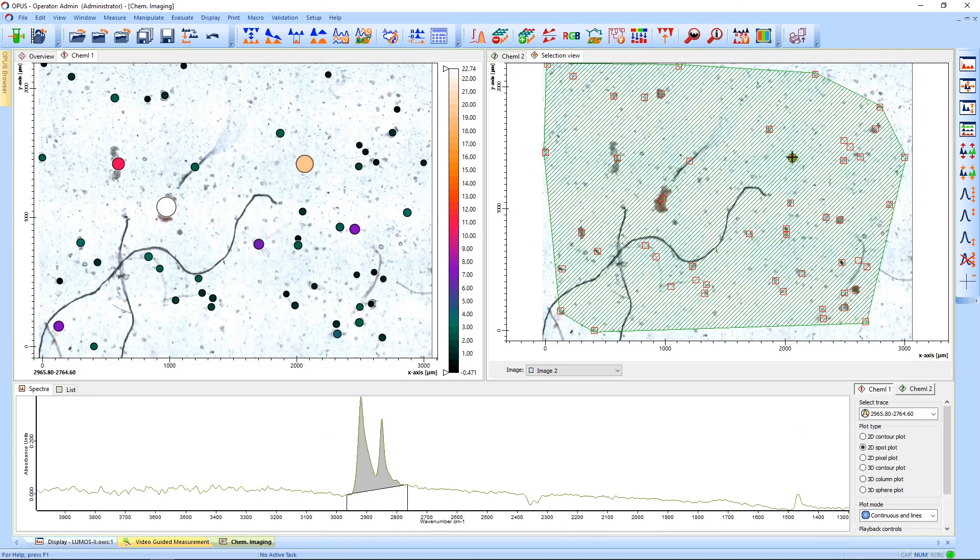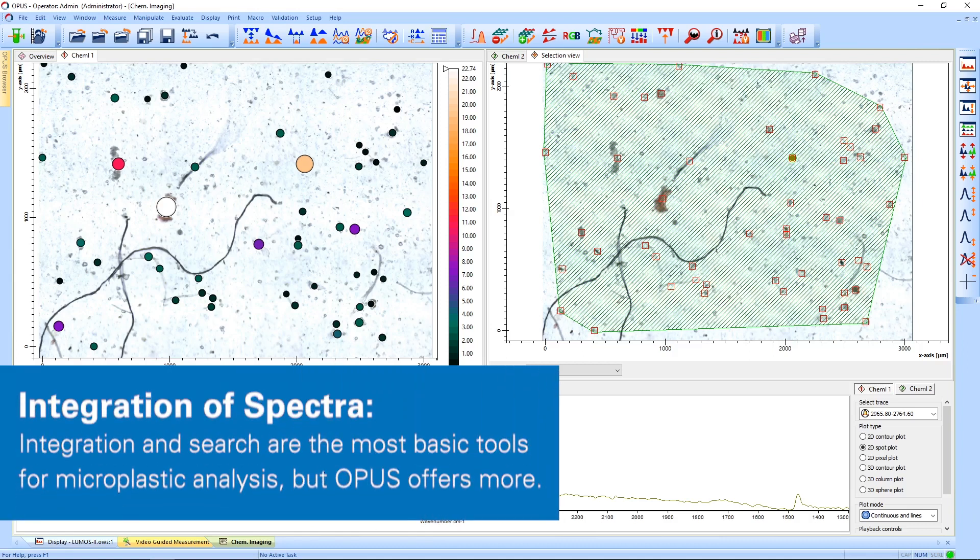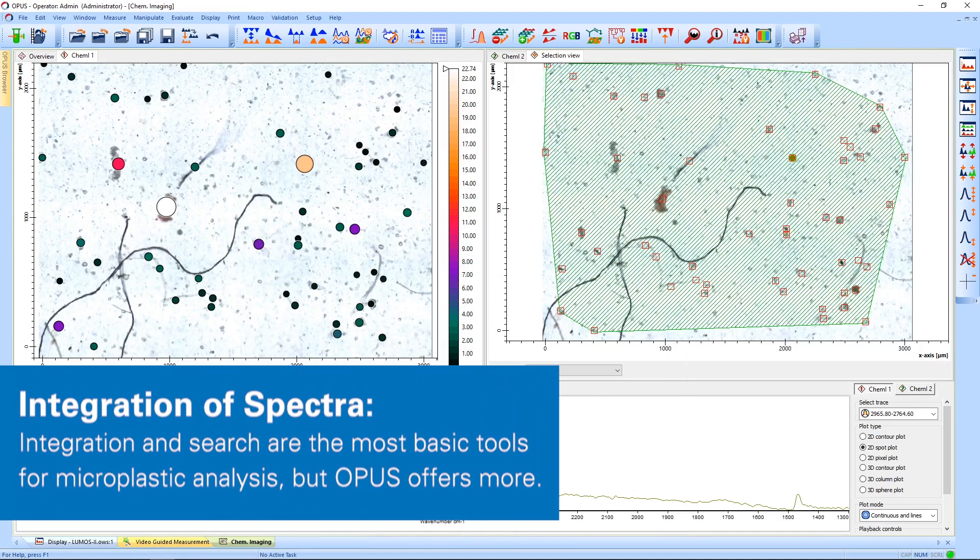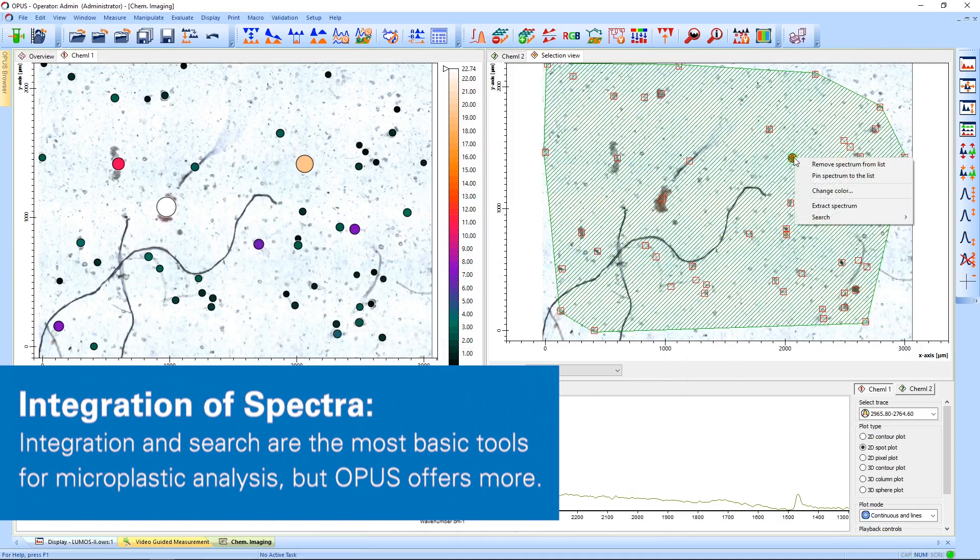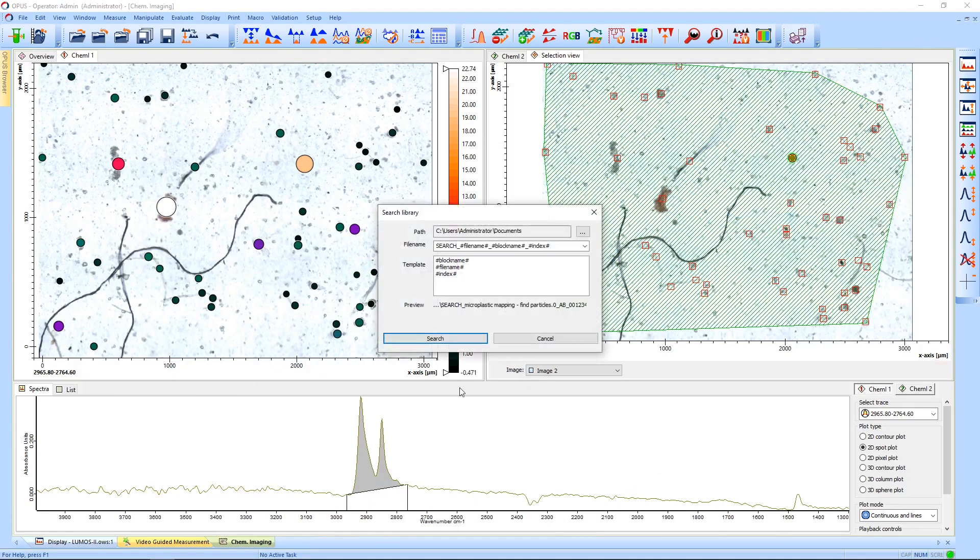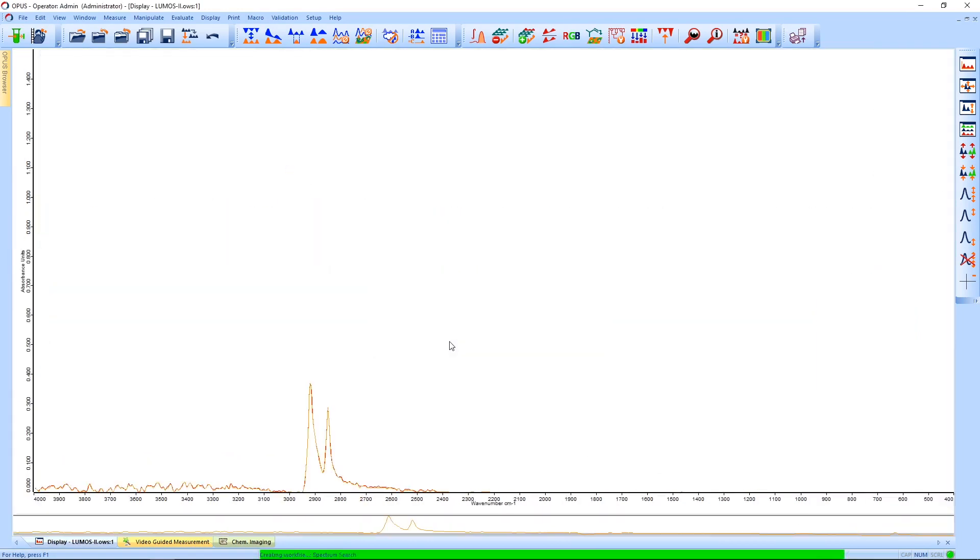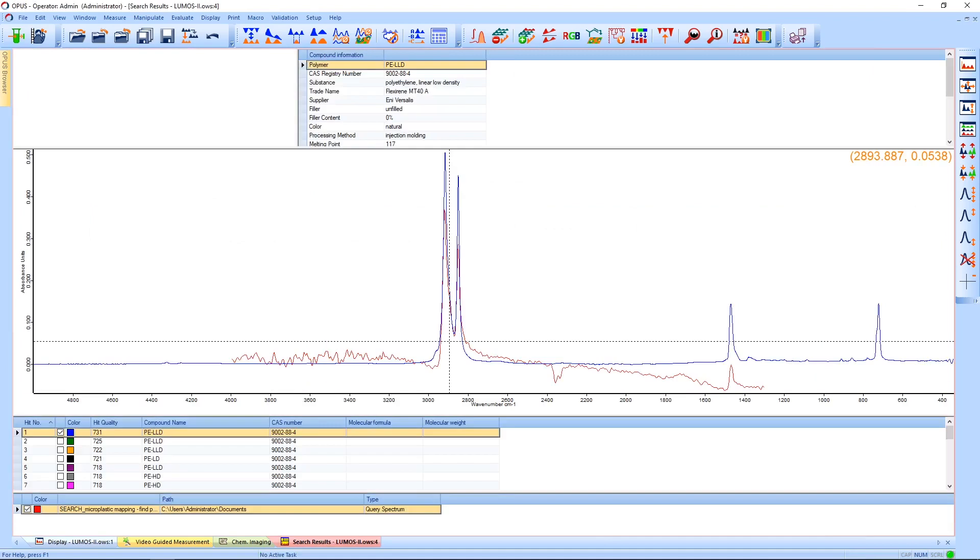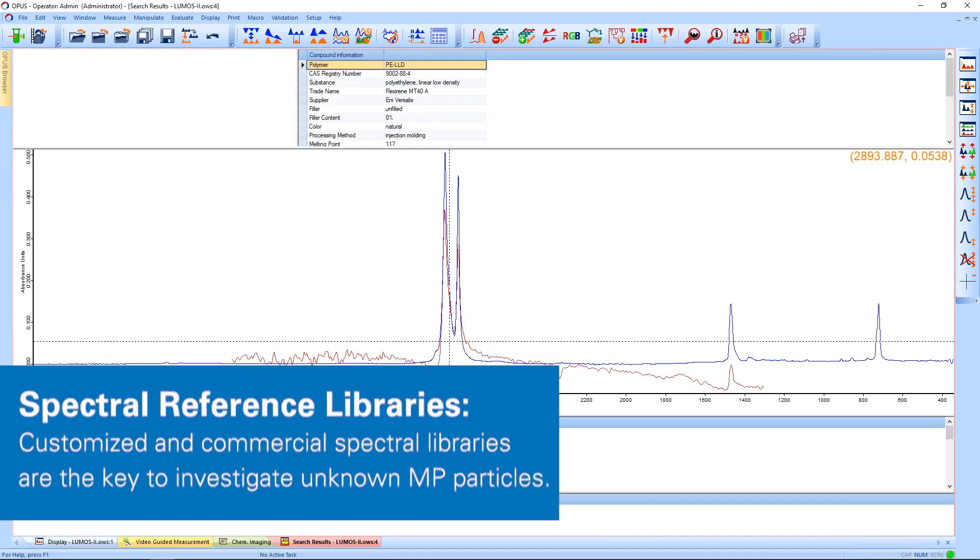When you click on a spot, the spectrum will be displayed in the color corresponding to the spot. On the left-hand side, you see a chemical image generated by the integration of the CH region. If we want to identify a particle, we can simply click on it and perform a library search. From the result, we can clearly see that this particle is polyethylene.